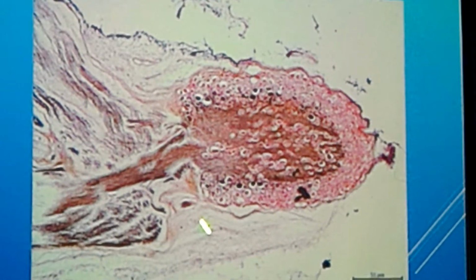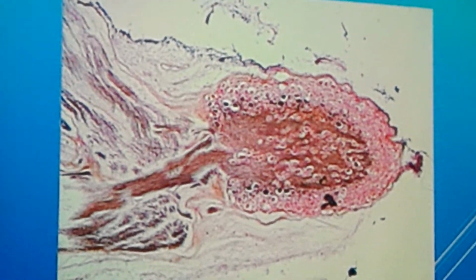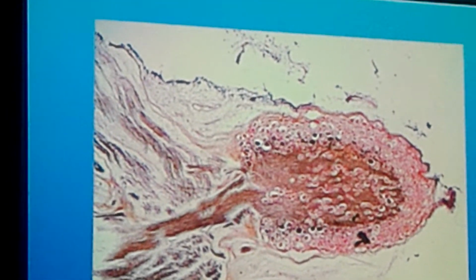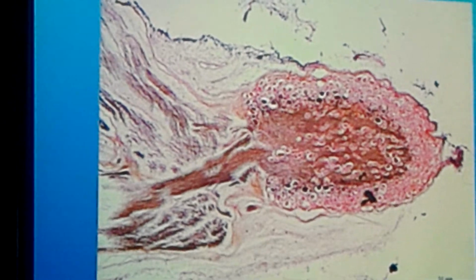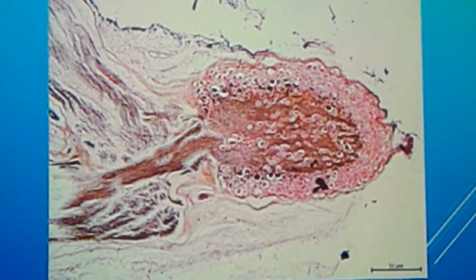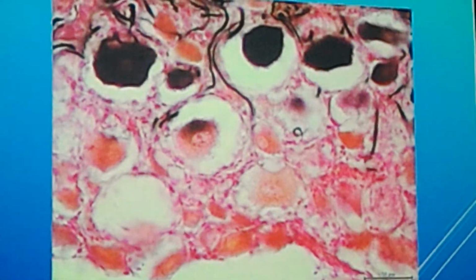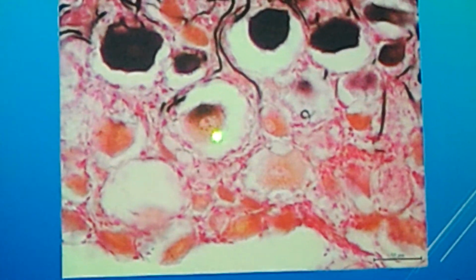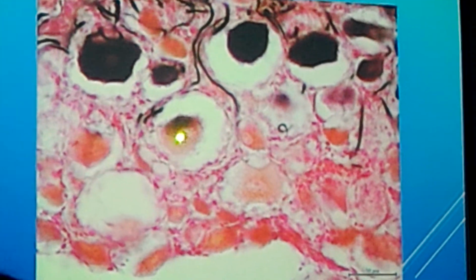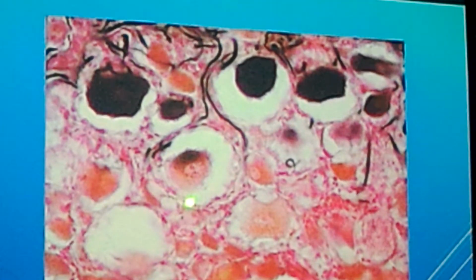Classify according to function. Sensory. You have a 50% chance of getting it right. It's either motor or sensory. Sensory. I think so, because it just senses. This would be your cell body. It has shrunk. The nucleus is located at the center. You have your glial fibers and you have the presence of your satellite cells.